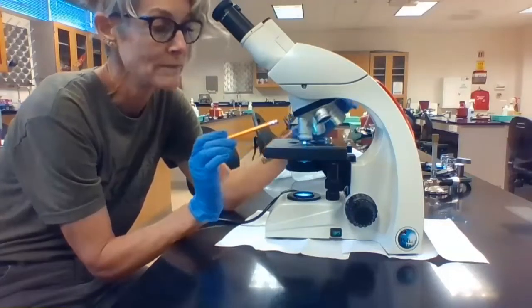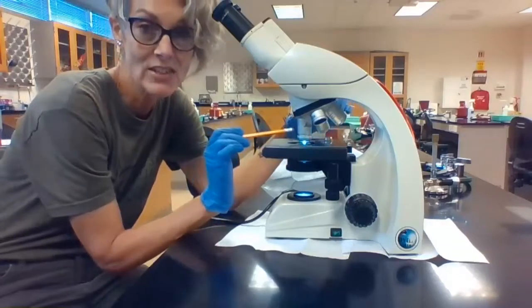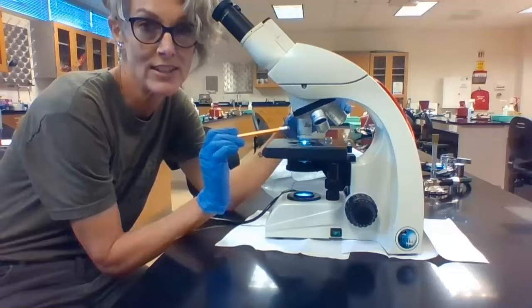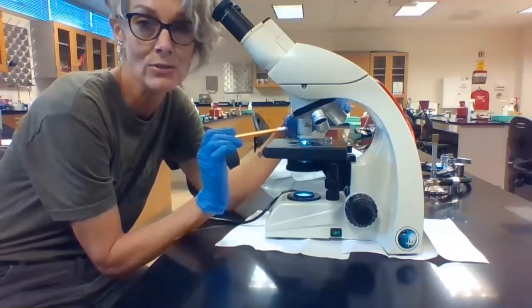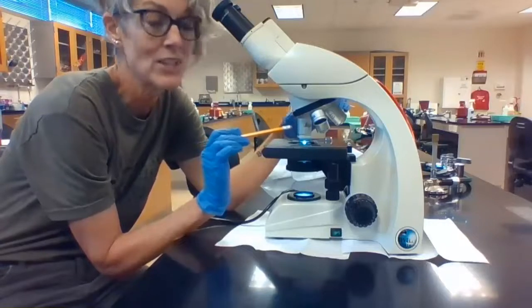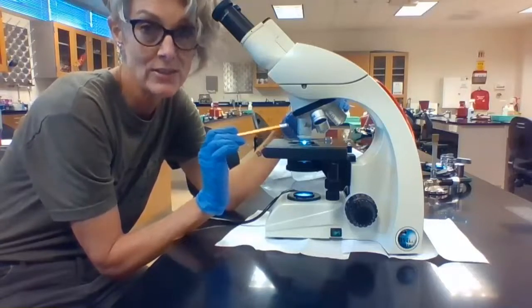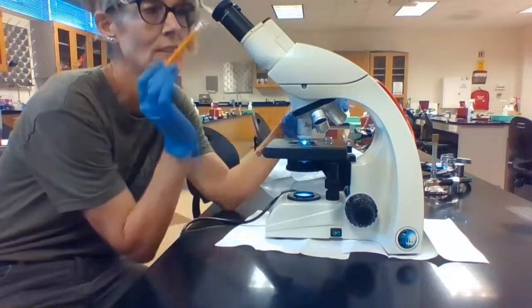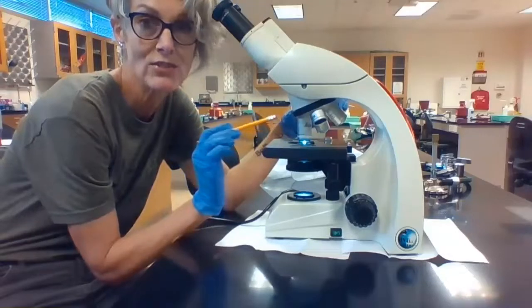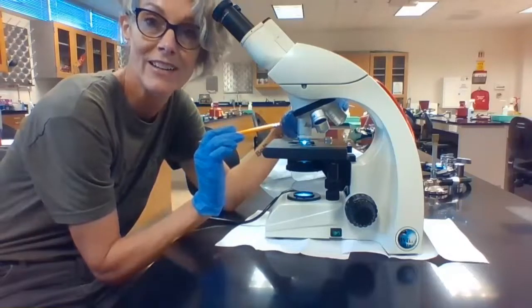The next lens has a white band — that is the oil immersion lens. This is the lens we're going to have to use to view our bacteria. This has a magnification of 100x. So 100x from oil immersion times 10x from the ocular gives us the maximum magnification for this microscope: 1000x.